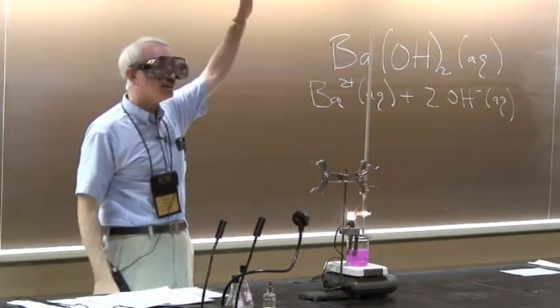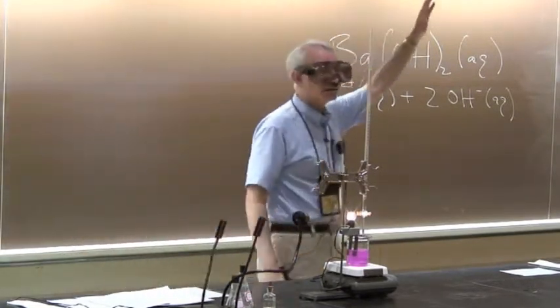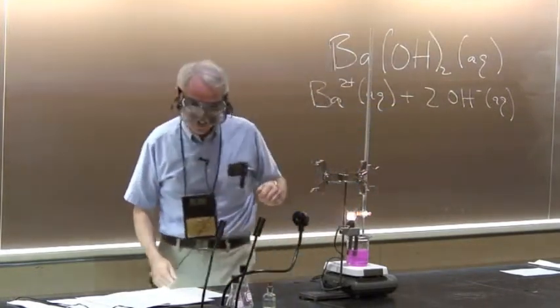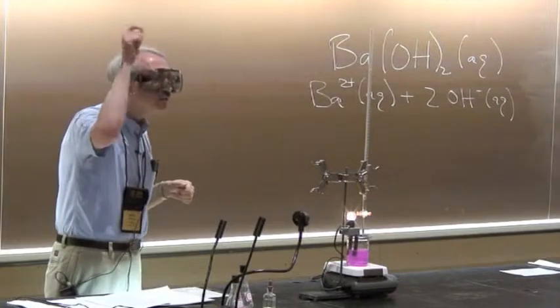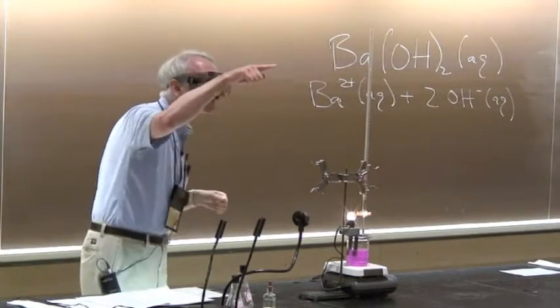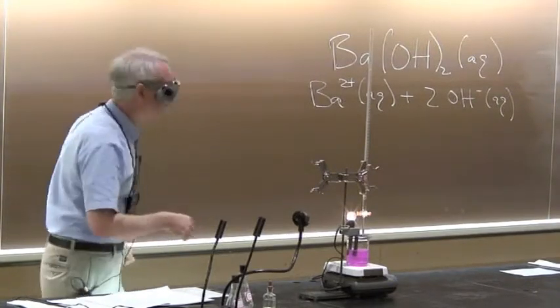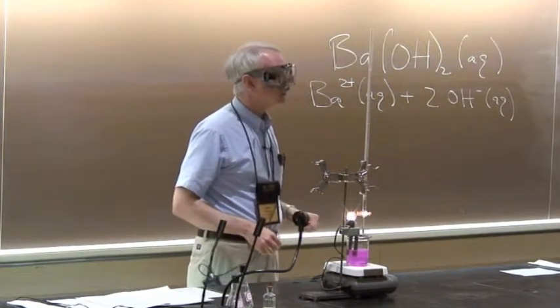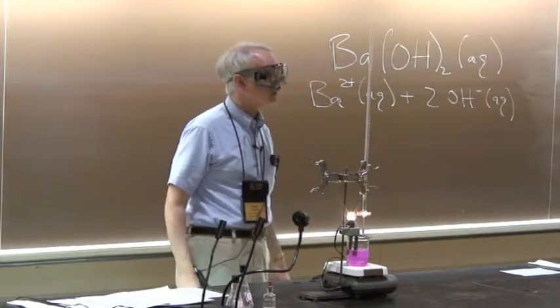How many think the pink color will not go away? He said he's going to add it. Ryan, do you go? Okay. Let's try. There's one more choice. Yeah. Go away slowly.